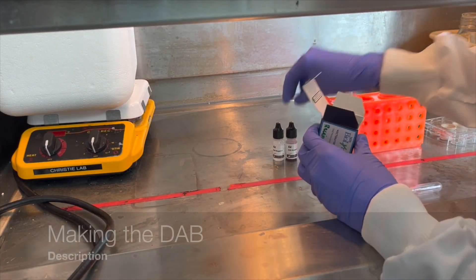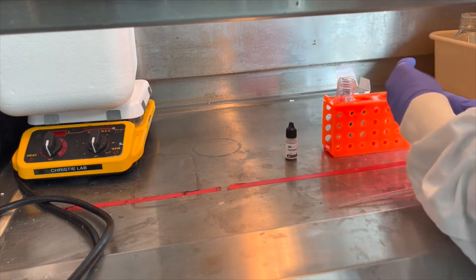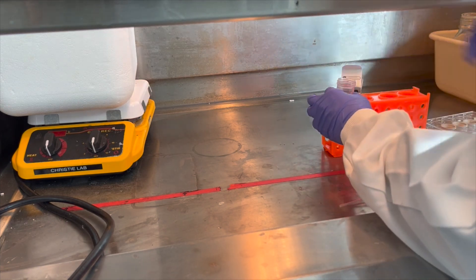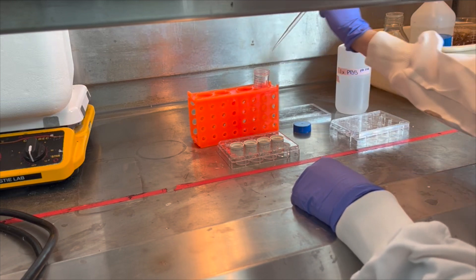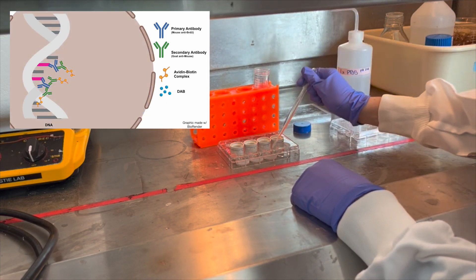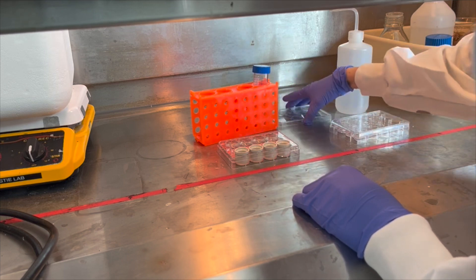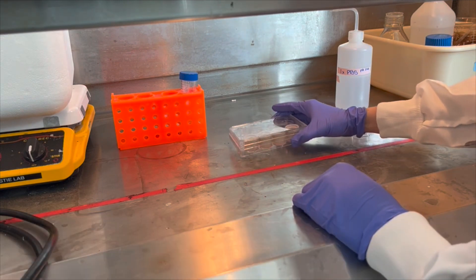Now it's time to make the DAB solution. We are using a DAB substrate kit from Vectostain Laboratories. Working under a fume hood, add 2 drops of reagent A, 4 drops of reagent B, and 2 drops of reagent C for every 5 mL of distilled water. Move the tissue into wells containing the DAB solution. This is where a chromogenic substrate is added — the previous enzymes react with the substrate and release a color precipitate. You should see the tissue change color from light beige to brown within approximately 2-3 minutes.